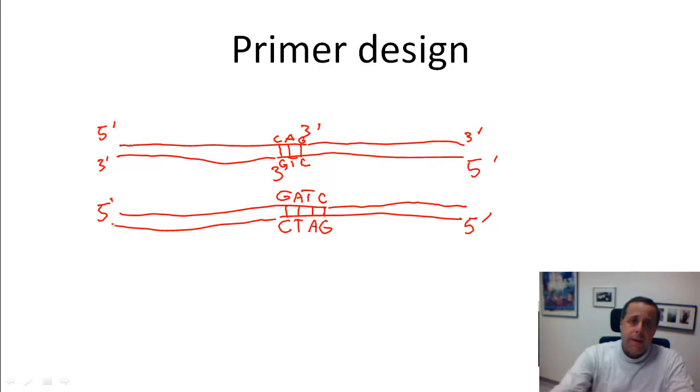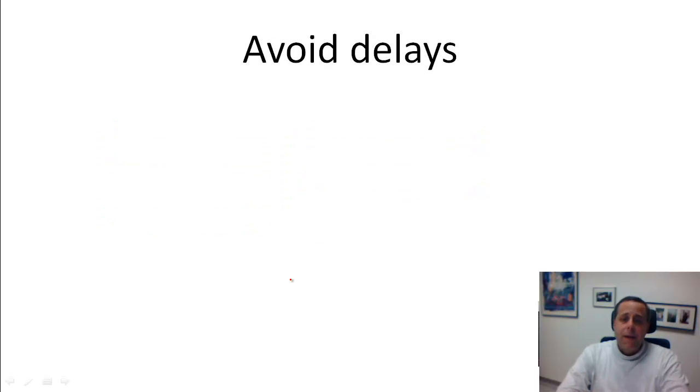Now, apart from that, it can happen that you still get primer dimers even though there's no obvious sequence that would provide you with an opportunity of the primers to anneal to each other. Well, why would that happen?